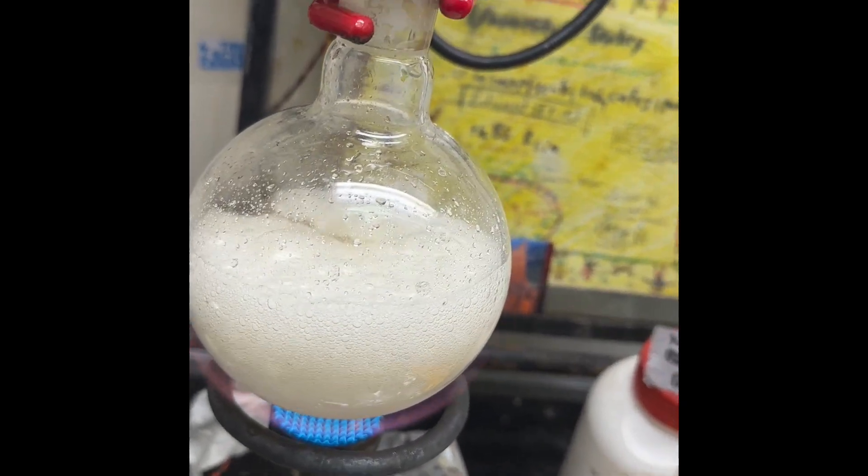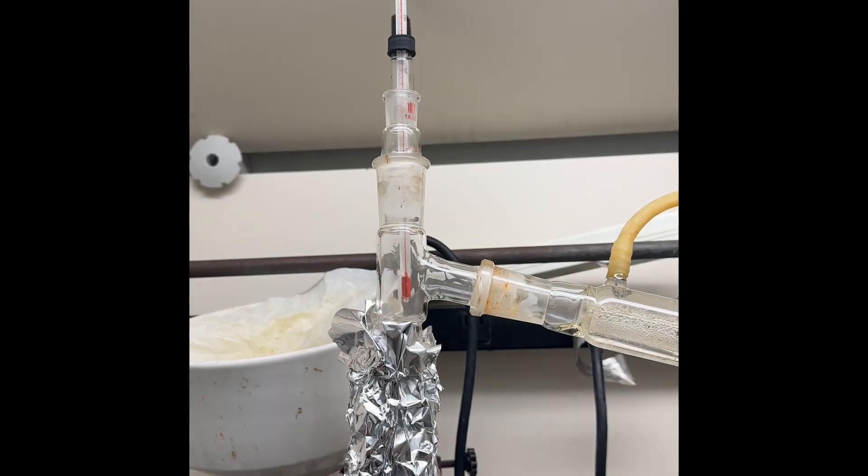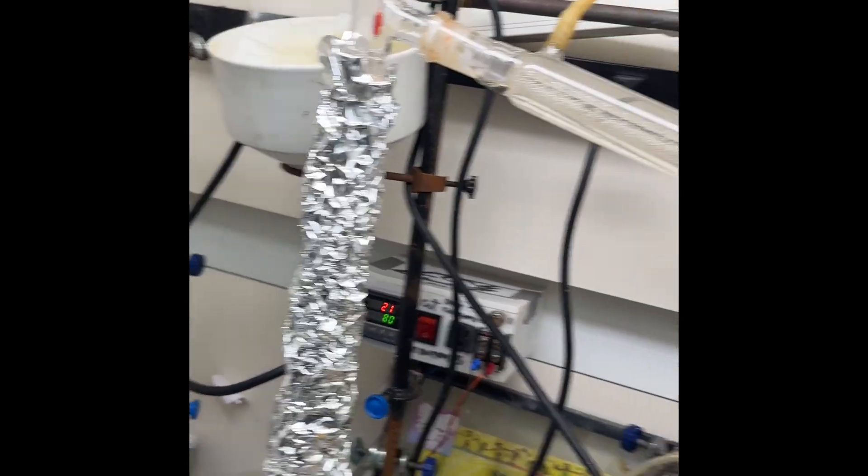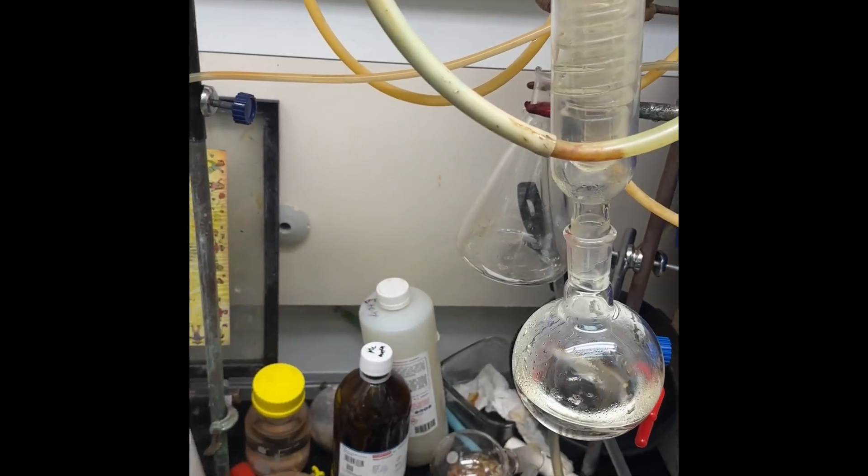You can see some white fuming, so that's traces of sulfuric acid making it over. Obviously slight excess of acid, so we stop heating and we wait for that to stop dripping.